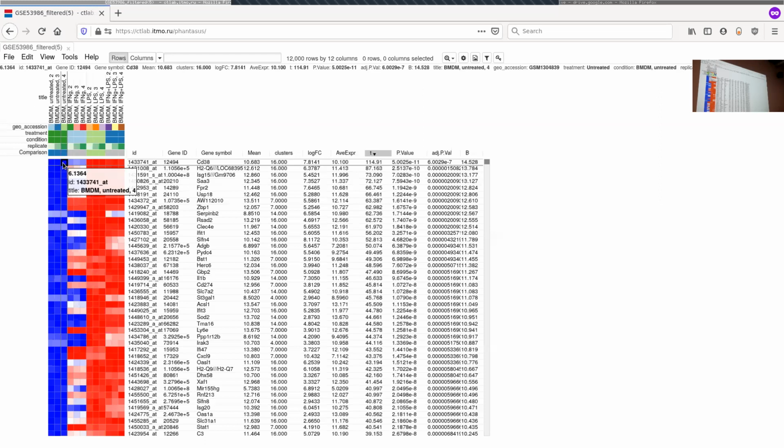So basically, we assume that gene expression is normally distributed in one condition, and normally distributed in the other condition, and the null hypothesis is that both these normal distributions have the same variance and the same average value.